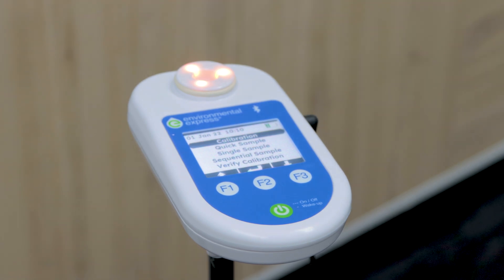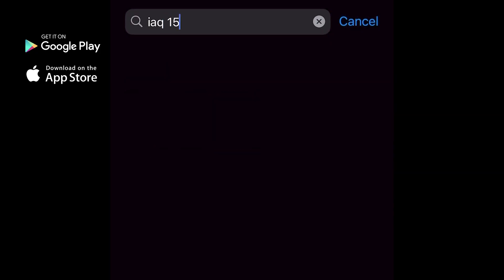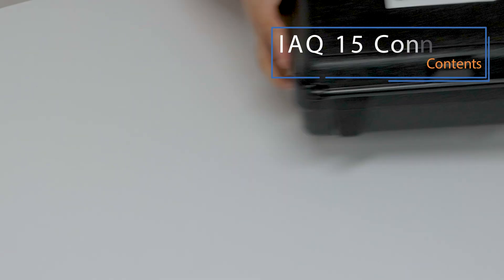It is also the only sampling pump to feature calibration verification and accuracy at 15 litres per minute. Record sample results accurately by using the IAQ 15 app to receive test results.